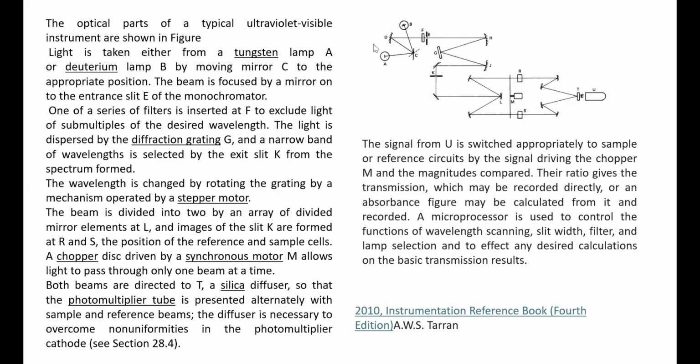Now here I have tried to share with you the light path diagram. So let's see what the parts of this diagram are. You are seeing some straight lines. There are some mirrors or optical systems, right? And in addition to that, you are seeing some small letters, A, B, C, right? Each letter symbolizes something. What that something is, we have to understand.